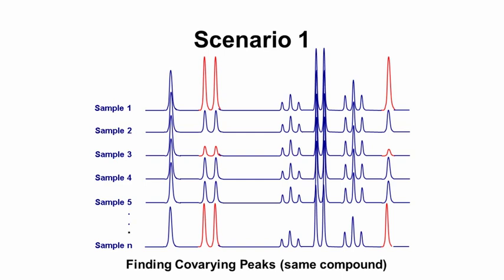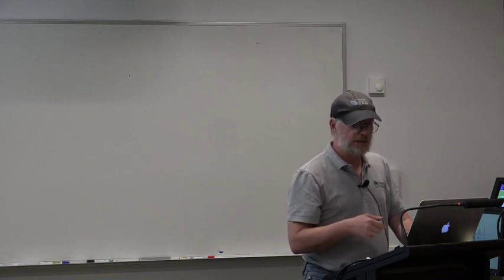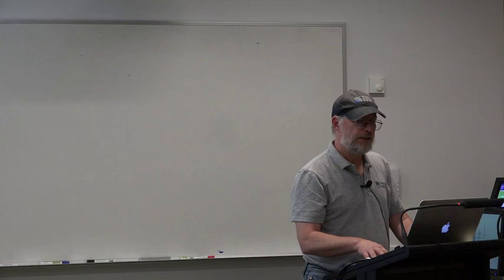So what you're basically seeing is a very strong covariance among these three peaks. Therefore, they must belong to the same compound. That's an important thing that you can get by looking at statistics. Now, of course, we could do this using COSY or TOCSY and see that, in fact, there's coupling between these two. But if we are only doing 1D, this effectively is giving us a statistical TOCSY.